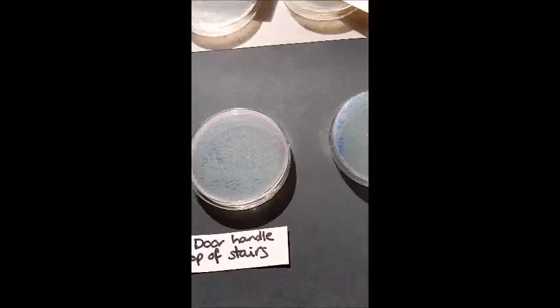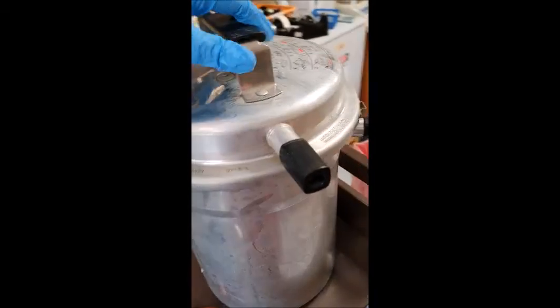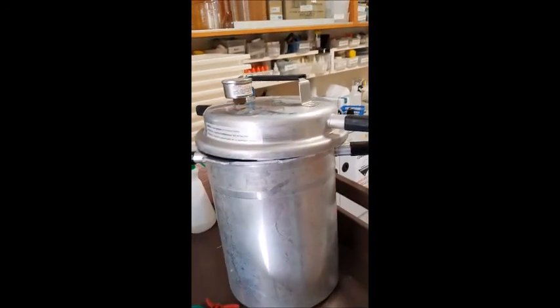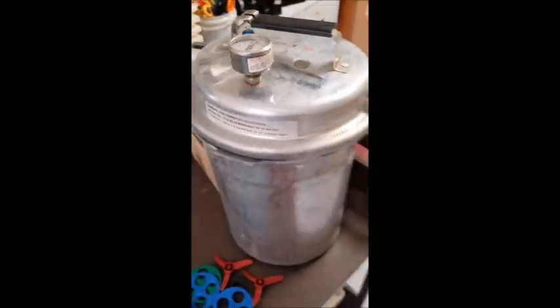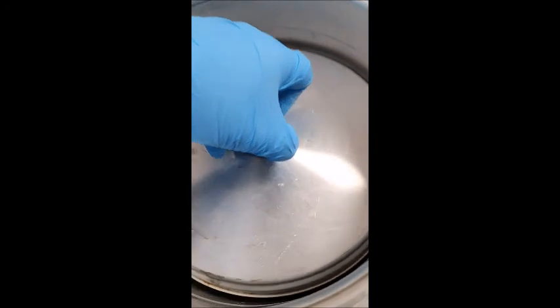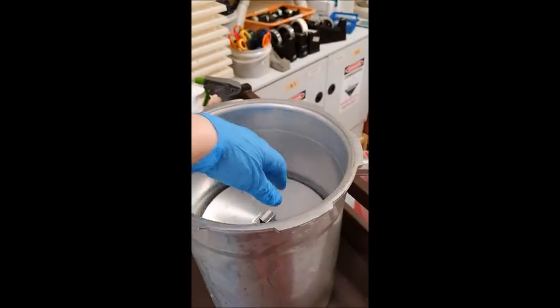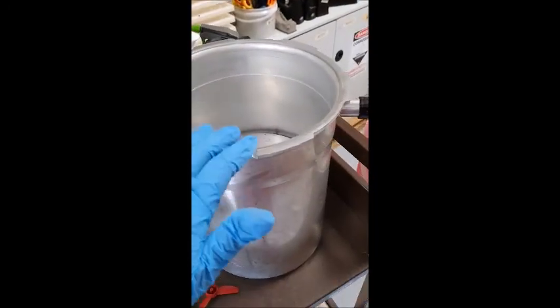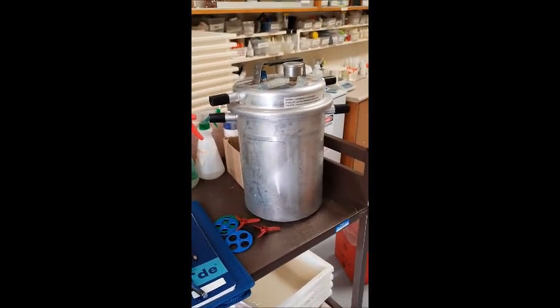Now, when I'm finished with all this bacteria, I am going to dispose of it in my autoclave, which I will show you here. Ooh. So this is an autoclave. It's a device, kind of like a pressure cooker. It has this gauge on it to show you the pressure, the PSI. When you lift it up, you put water underneath this thing. So the water goes in there, and then I put all the agar plates in oven bags, heat-proof plastic bags, put them in here, put the lid on it, and then I put that on a hot plate, and yeah, it gets over 100 degrees.